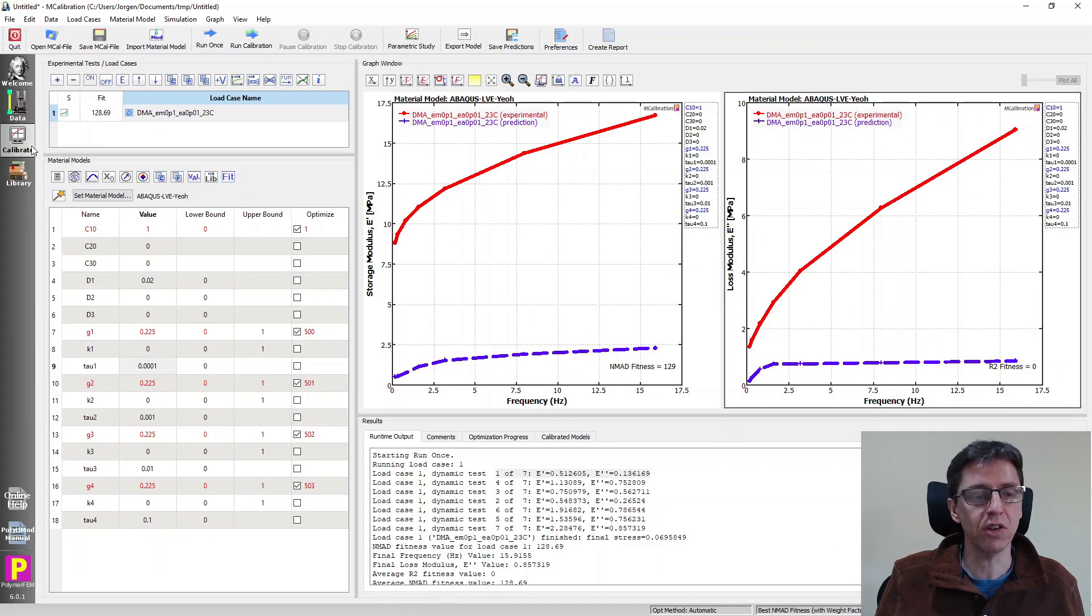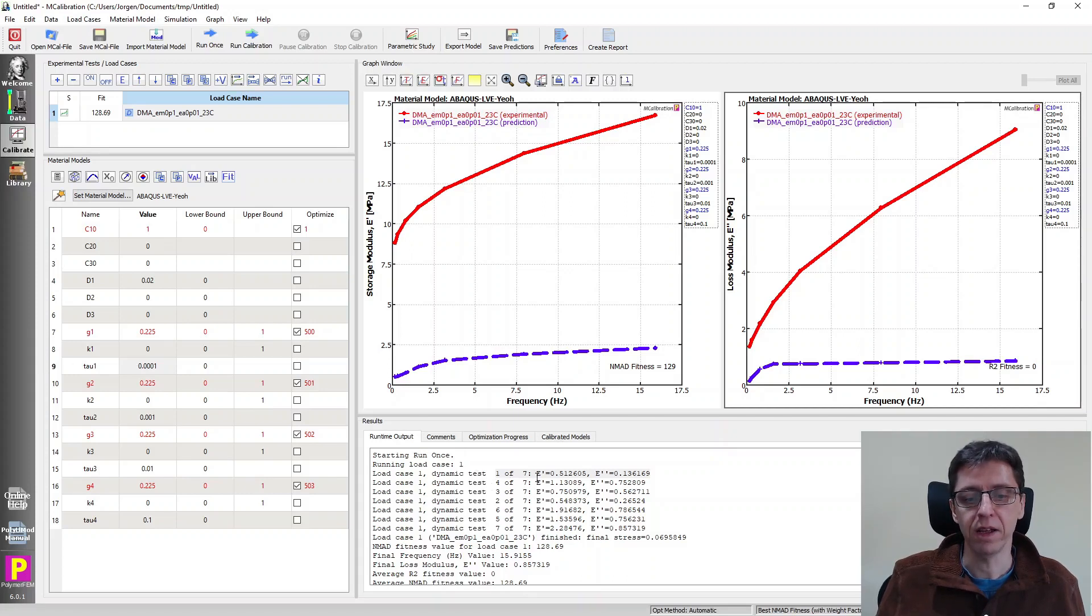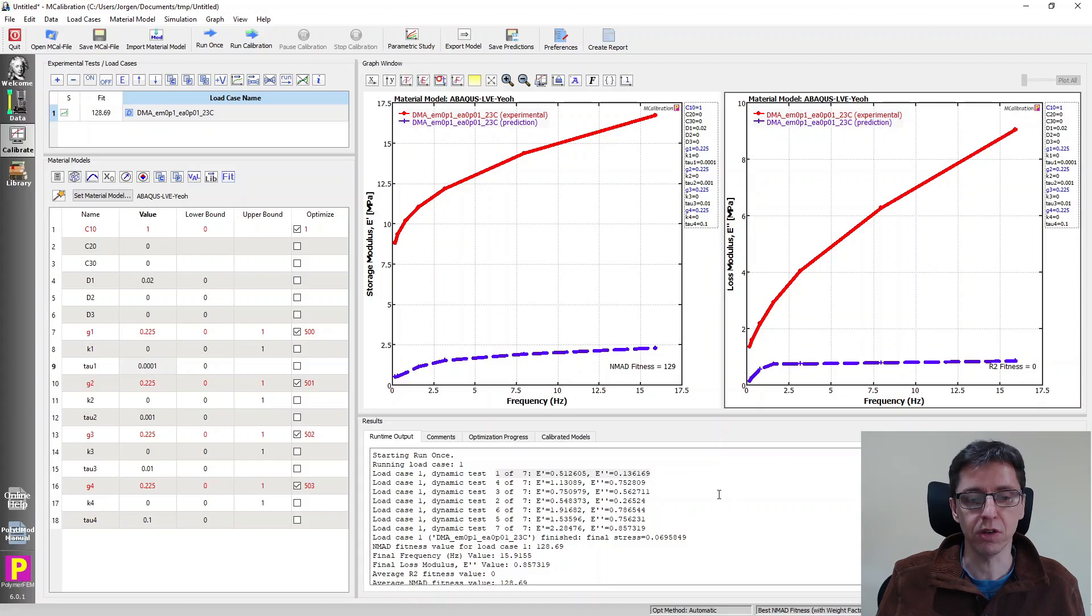One row specifies the mean strain, amplitude, the frequency, and then the reported values. And that's why MCalibration does the same thing. So it considers each of those rows a separate test and it calculates, runs that test and calculates the storage and the loss modulus from that data. That's kind of the procedure it does.